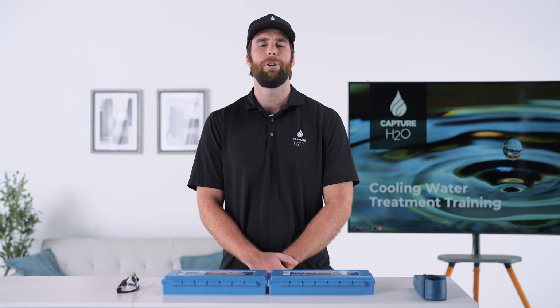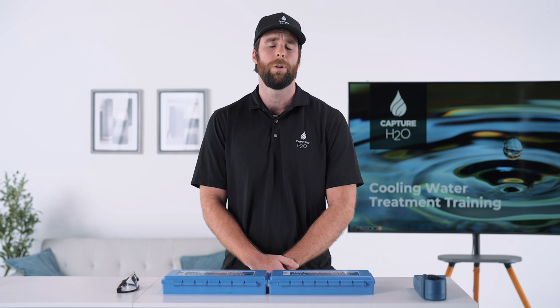Today I will be discussing the importance of operator logs and the tests associated with them. Operator logs are a crucial part of the Capture H2O high cycle program to ensure that what is being reported from the inline probes is accurate.